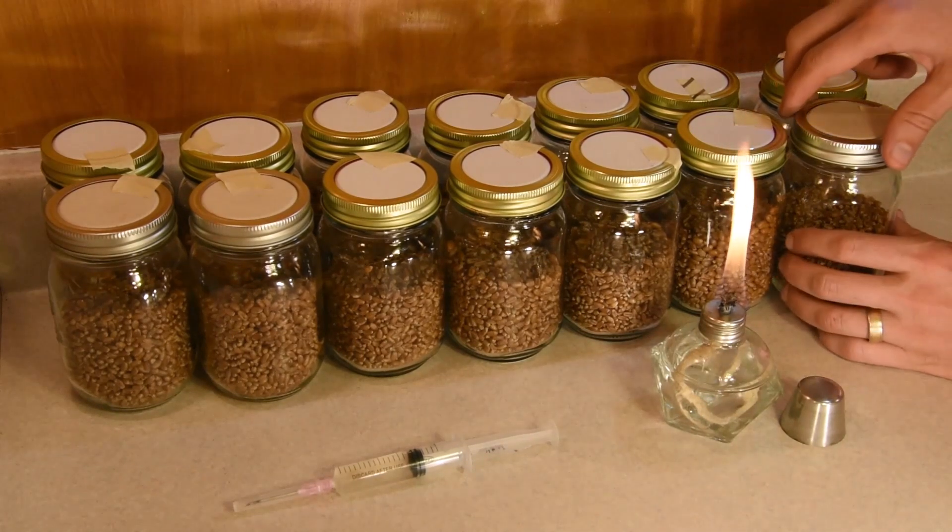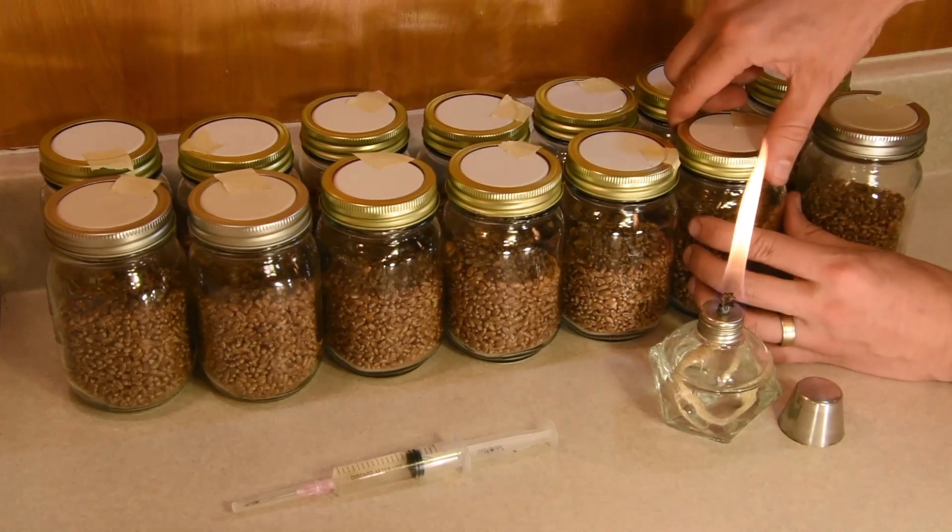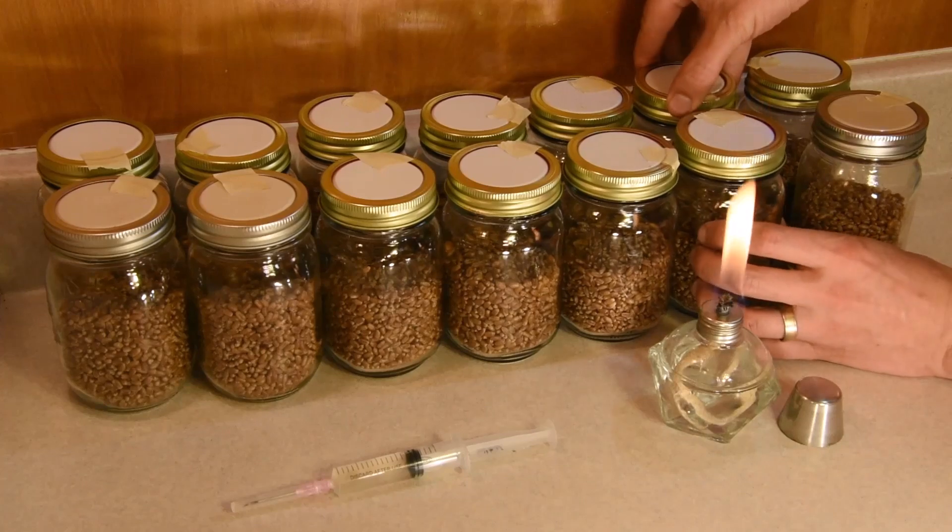I also use an alcohol burner to sterilize the needle before I start, and just in case I make any errors, I can sanitize it in between transfers.